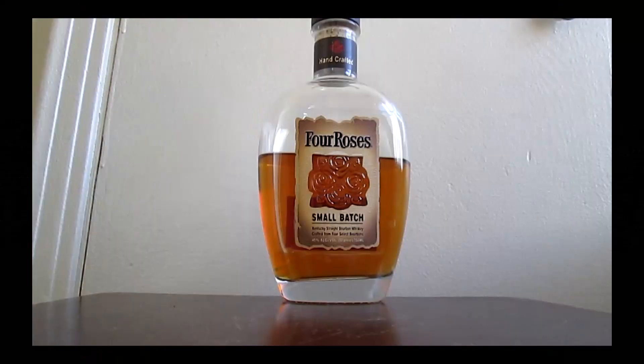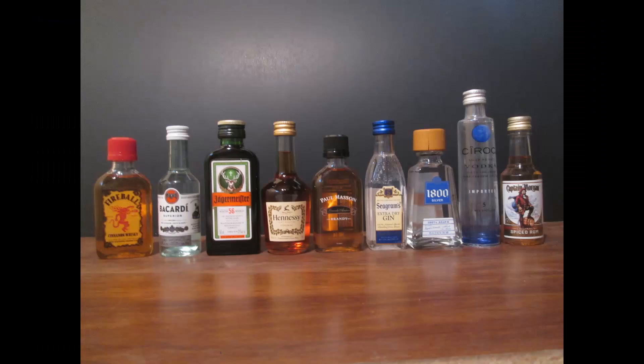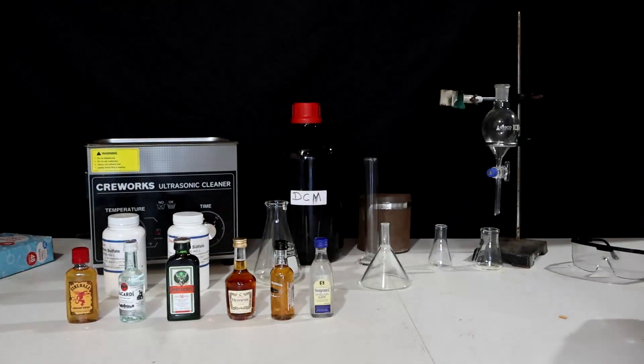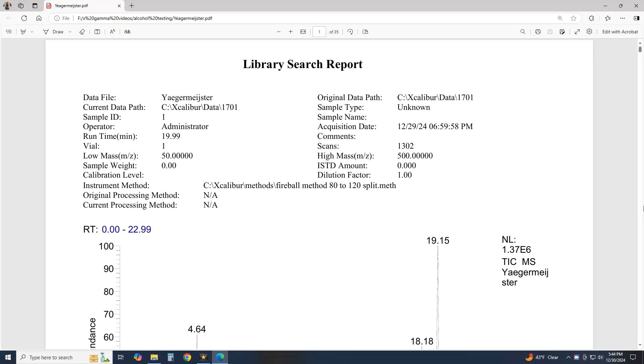Hello and welcome back. In early spring 2022, I analyzed the anion makeup of nine popular brands of liquor. I wanted to revisit this project using the GC-MS to check the organics in those same nine brands for a comprehensive look at their chemistry.